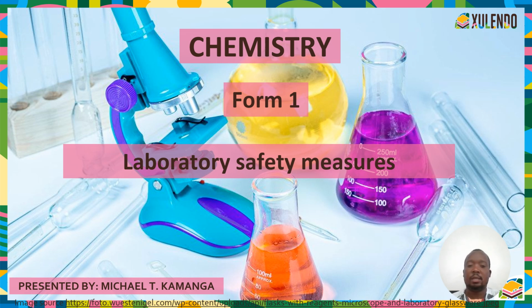So we'll be doing laboratory safety measures. So far we have defined a lab, and we have looked at types of laboratories. Do you still remember the types of laboratories? Yes, we have a formal lab and an informal lab.